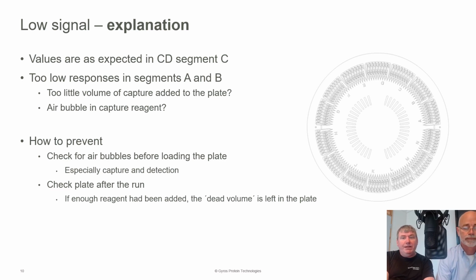Yeah. I mean, we've had an example where somebody has added exactly the volume stated on the work list, and obviously their pipette is under pipetting. It might be, so typically you're not relying on the pipette to give you accurate pipetting as long as you've created your dilution series accurately. But when it asks for 20 microliters, you need 20 microliters in there.